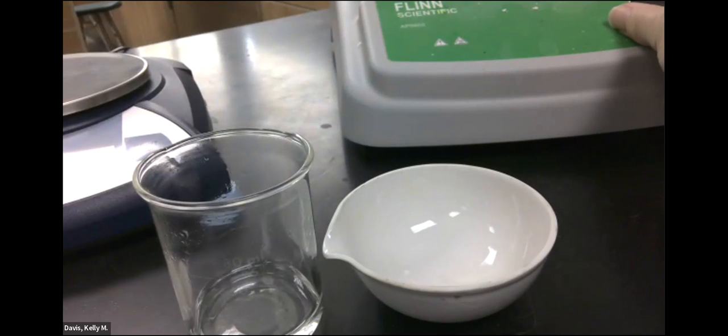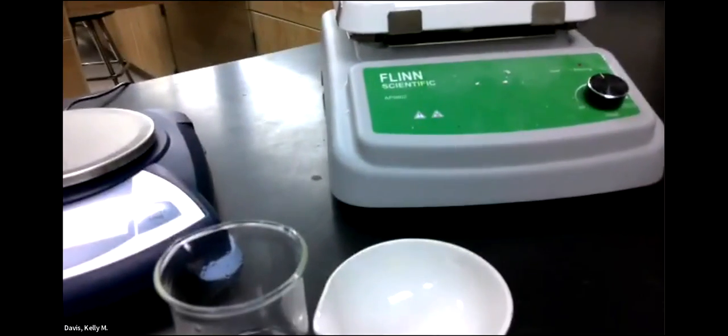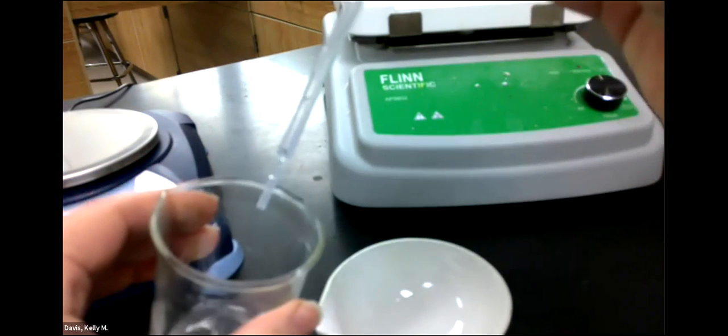I'm going to turn the hot plate on so that it starts getting hot, and we'll get it started evaporating. I'm going to transfer all of it to the dish.